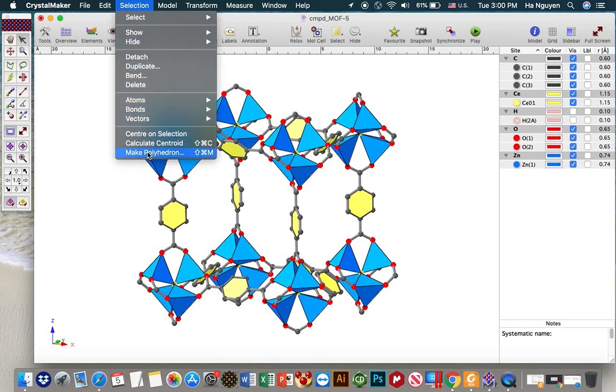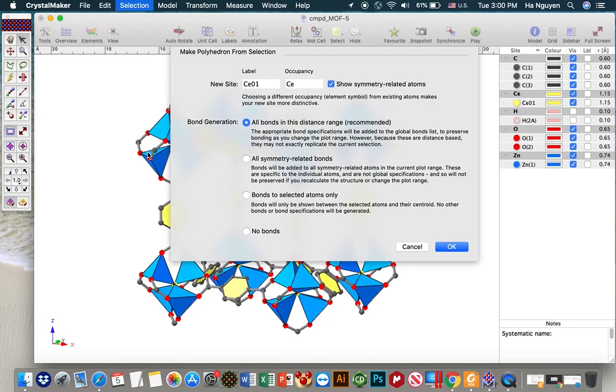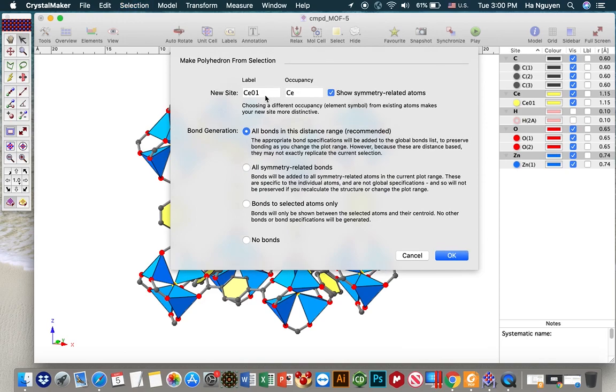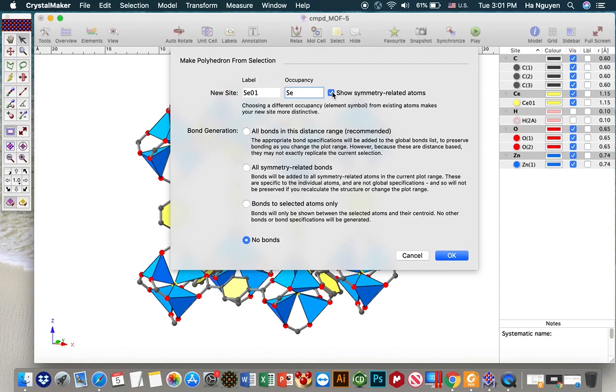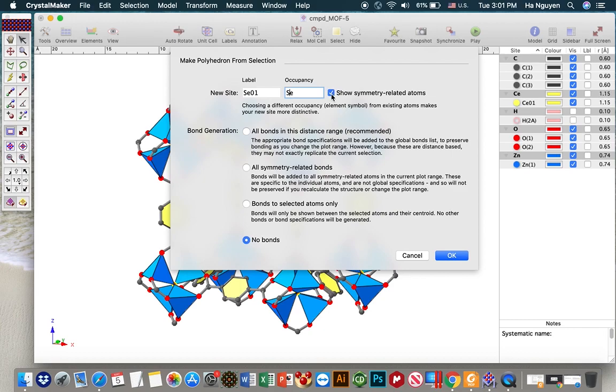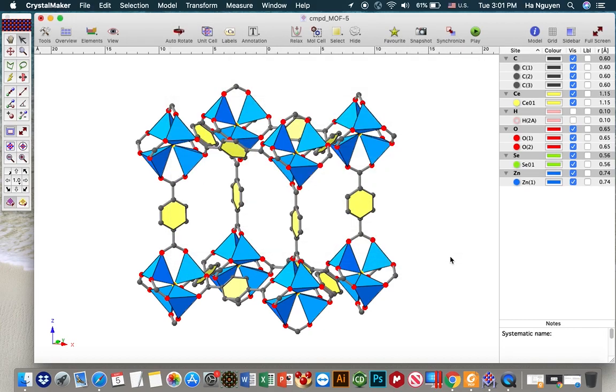And selection, make polyhedron. So here let's say we put it selenium, and then we don't need to generate the bond between the oxygen center centering at the center of zinc cluster to the pore. So in order to do that, instead of choose this one, we choose no bond. And we don't need to show symmetry related atoms because we only show one cage in the structure. So I uncheck this one and then okay.